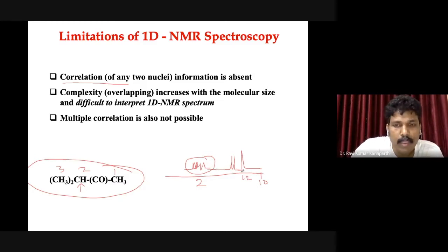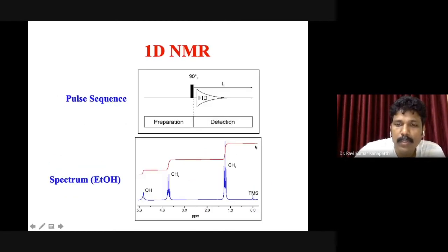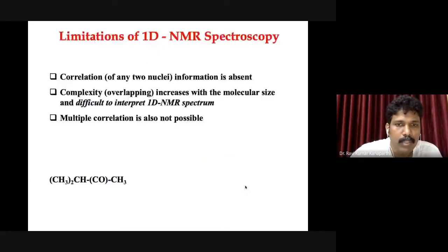Since this is a simple molecule, you can easily say from the splitting pattern and from the logical background we have so far that I can interpret. Fine, but just imagine a bigger molecule with so many methylene, methine, and methyl groups. If everything resonates at one place, that makes the complexity. That's what I'm trying to stress.